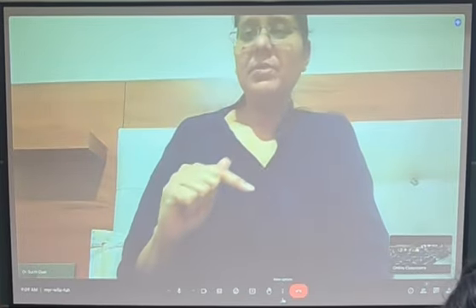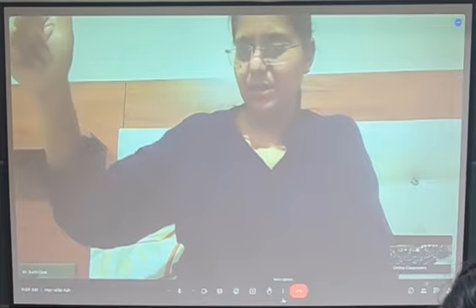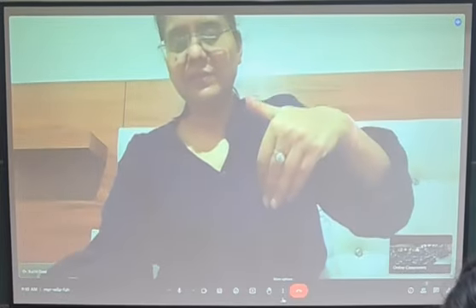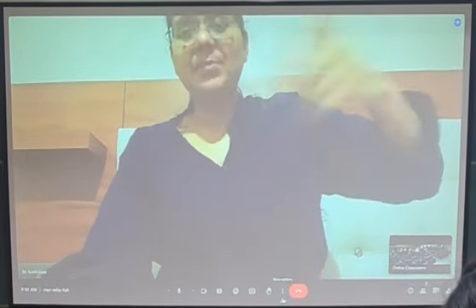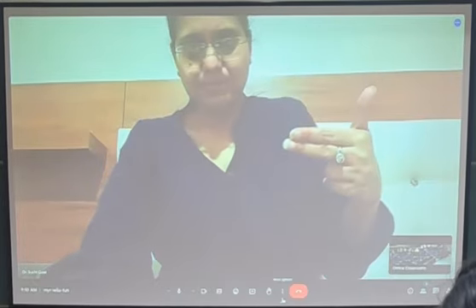But again, my problem will be that although I will have a bigger pellet at 3 OD, I cannot distinguish because there are some dead cells and some live cells. So I cannot distinguish between live and dead cells in this case also. I know I have a lot of bacteria, but how many are live or viable bacteria, I will not have that idea.